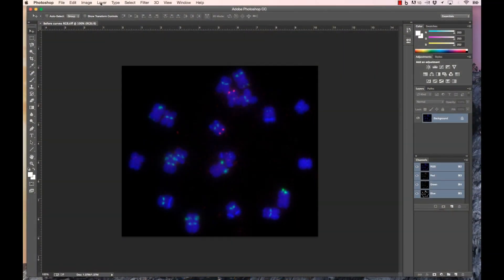Better signal definition can be achieved during image processing by using the curves feature of Photoshop or a similar application. Curves often produces better results than brightness contrast adjustments. Let's look at an example. An adjustment layer is not used because the signals of interest are visible only in the red channel.